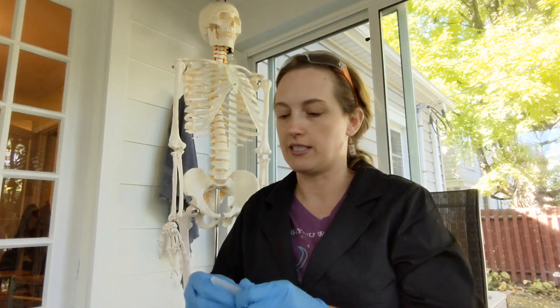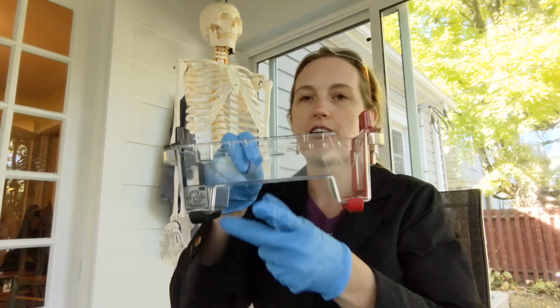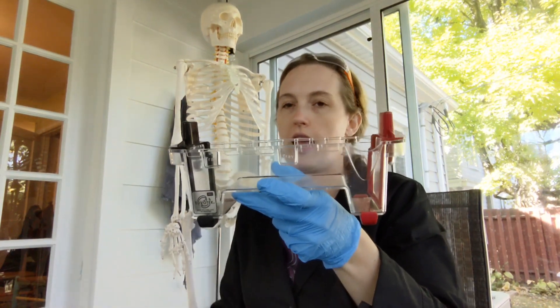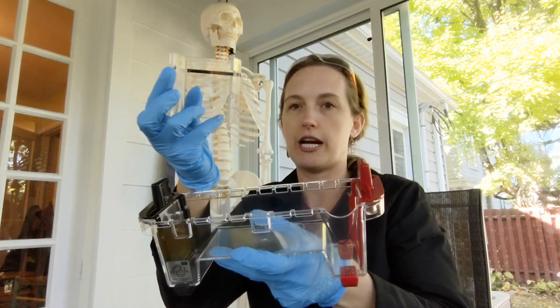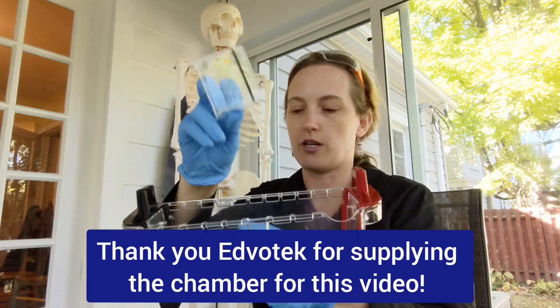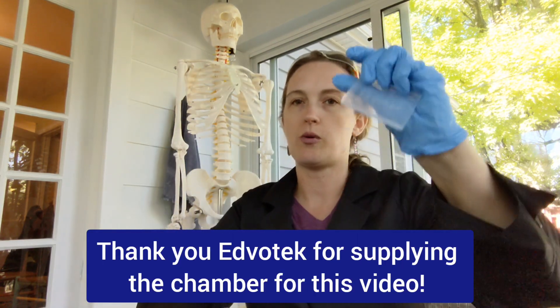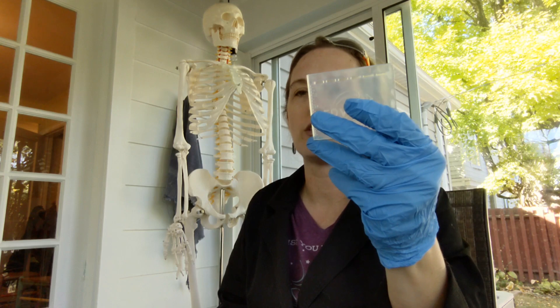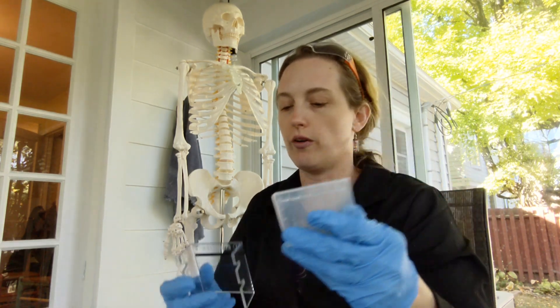So here's what we're going to be using today. First of all, I have my Edvotec M12 gel electrophoresis chamber and I have a small tray for a 7x7 cm gel. I also have a practice gel. These come with the chambers and they're really good for gel loading practice before you do the real thing.